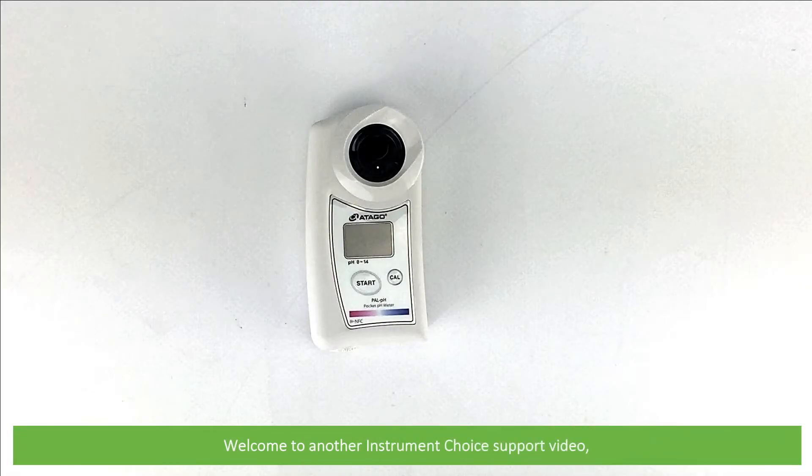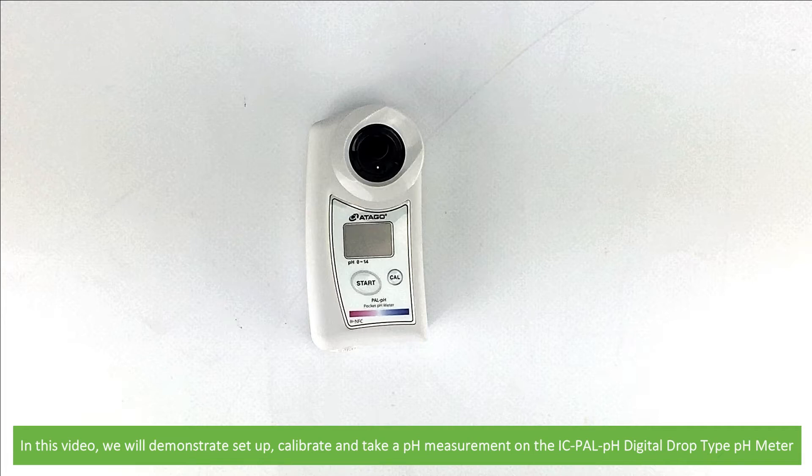Hi and welcome to another Instrument Choice support video. In this video we'll demonstrate how to set up, calibrate and take a pH measurement on the IC-PAL pH digital drop type pH meter.